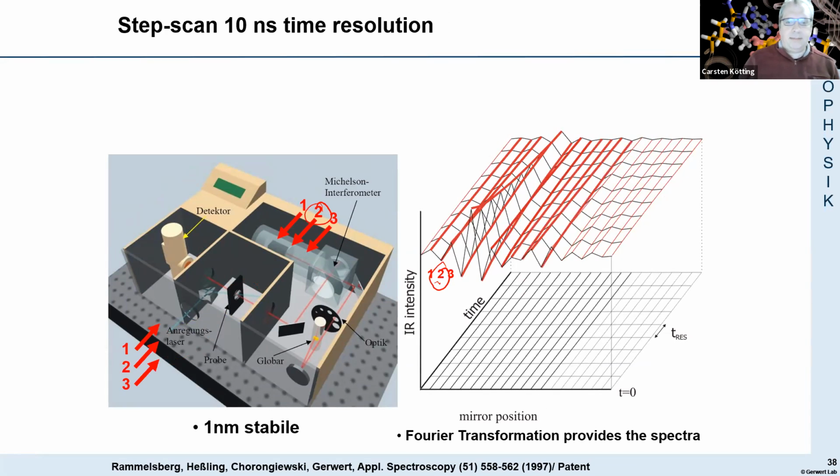And then after maybe 500 positions, you can slice your time-resolved data into interferograms with about 10 nanoseconds resolution. However, for this, it's very important to have exactly the same conditions after the reaction for each cycle. So that works very nicely with proteins which have a photocycle. But if you have a cage compound, you flash it and then it's gone.